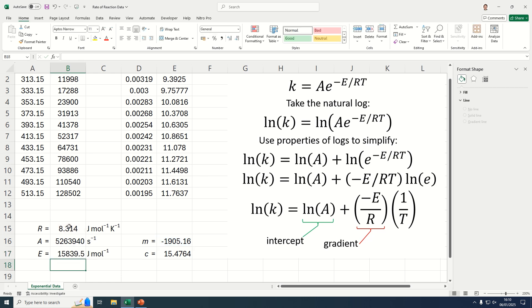That now gives us the activation energy of the reaction. And that's 15,839.5 joules per mole.